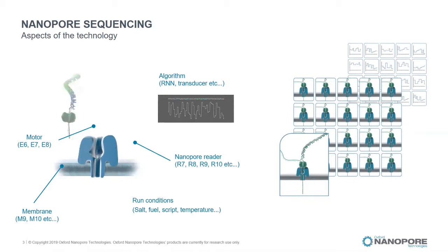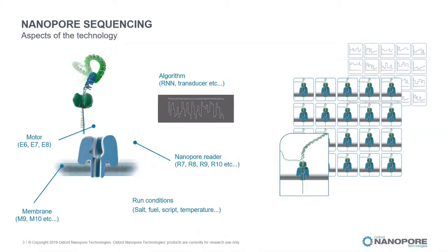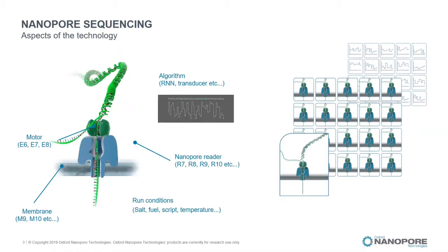An important point is that we do not use any fluorescence. We sequence the molecule as it is. So using this principle, we can sequence DNA and RNA. Sequencing RNA is not sequencing cDNA; we sequence the RNA molecule as it is. And also methylation or other modifications appear as a shape difference, and we can capture those differences as the ion current change.